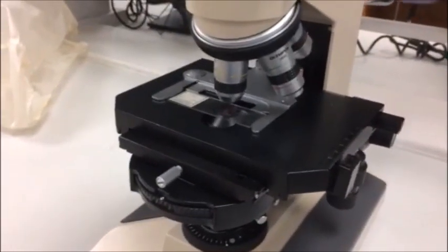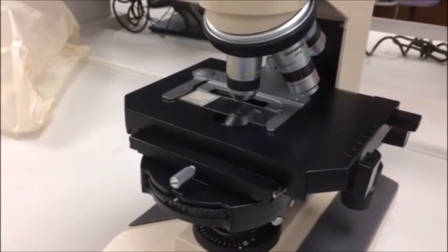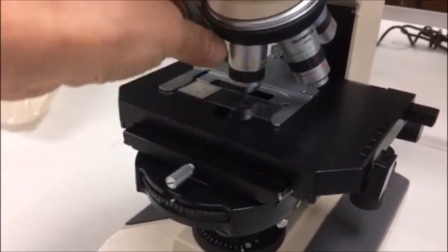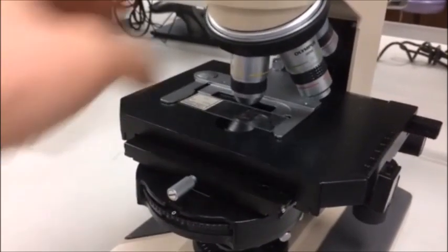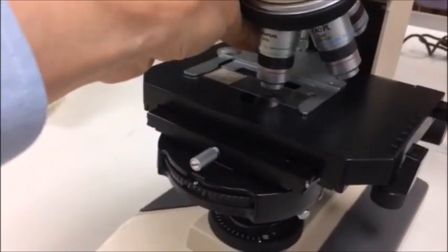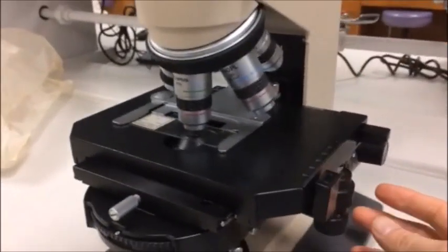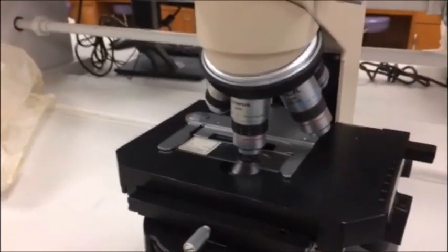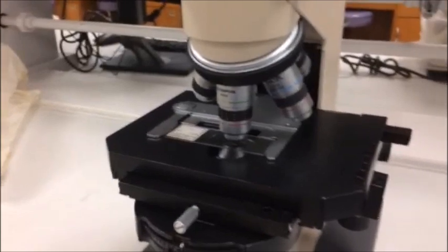One thing that you should keep in mind is that this adjustment of the condenser needs to be done each time you go to a different power in the microscope. So if, for instance, I want to switch from the lowest power to the next higher power, I can switch the turret like that. Then I may have to do a little fine focus adjustment to get the specimen in focus. Once I've done that, though, I need to check again to make sure the condenser is adjusted.